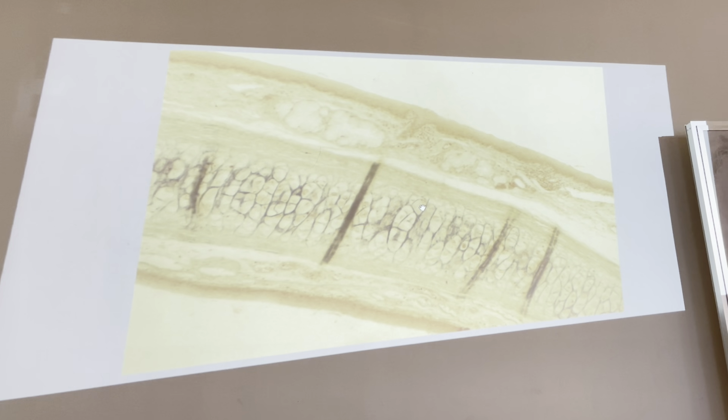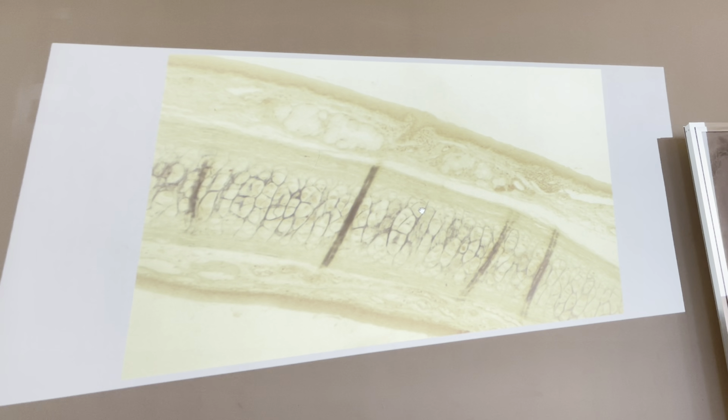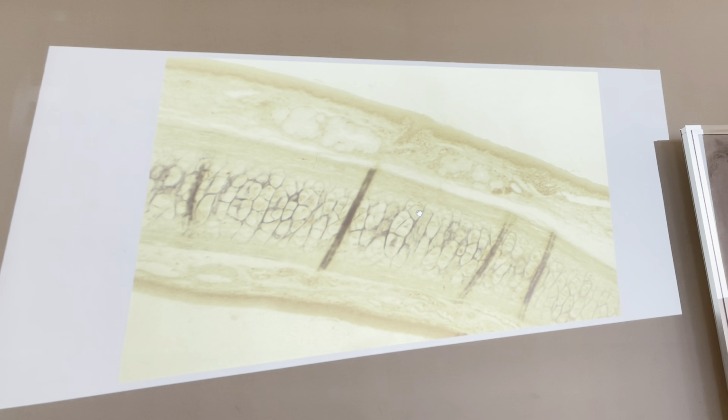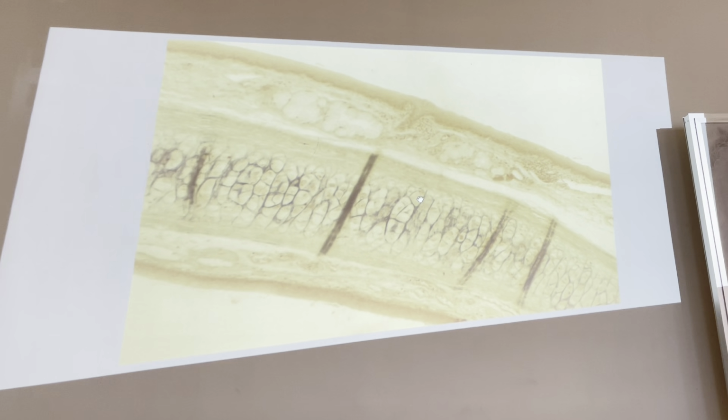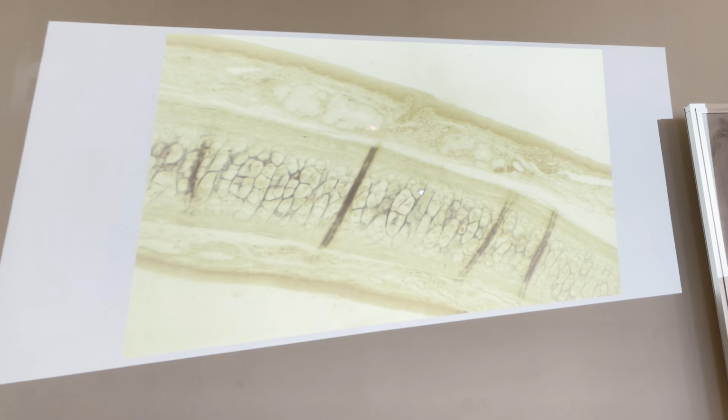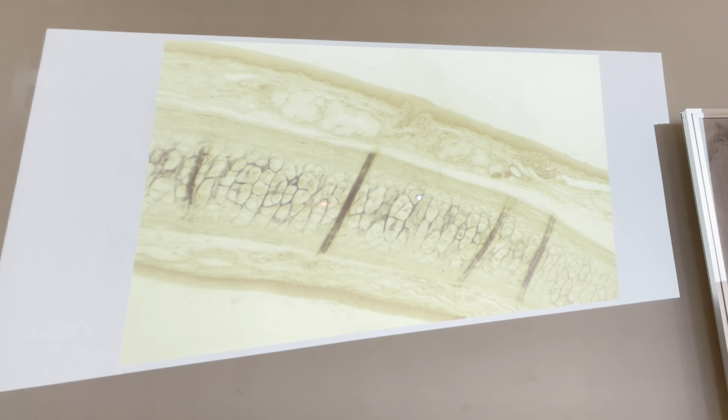That's all. The lamina propria is usually a loose connective tissue, and we have seromucous glands, and the core is elastic cartilage.